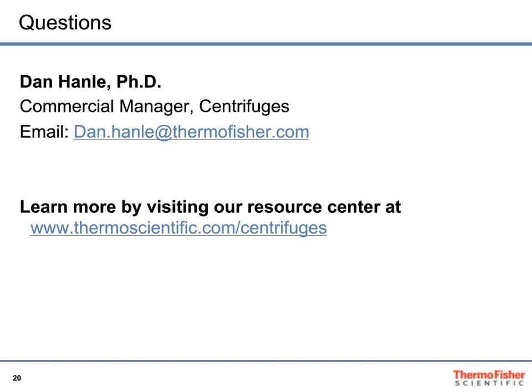Blood bankers work these machines very hard, so you really definitely want to make sure that you have done your homework, you've talked to different users, and you know what centrifuges are going to last and do well in a tough environment. I would say the second thing you'd want to do is check for technical support as well, because typically a blood bank is a group of people who cannot really afford a lot of downtime.